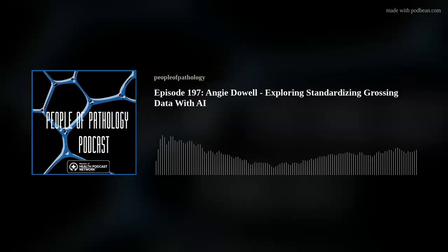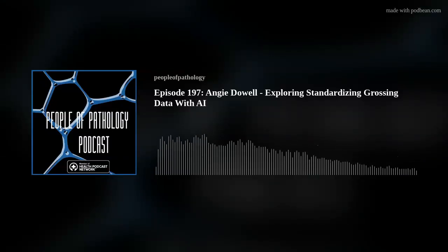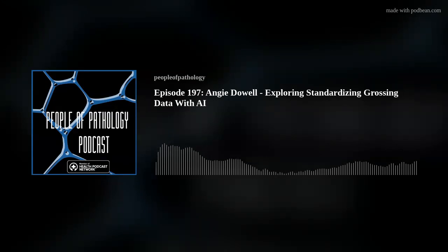All right, big thanks to Angie Dowell. So we delved into the topic of AI and pathology, specifically in grossing. Angie emphasized that AI should be seen as a tool to handle repetitive tasks, thereby freeing up PAs to focus on more complex, higher level thinking.